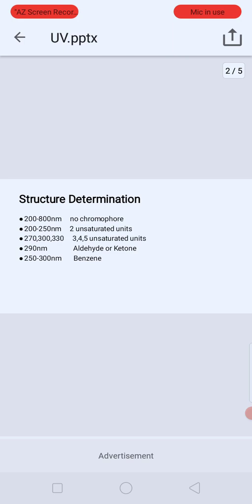Since different chromophores absorb ultraviolet visible radiation at different wavelengths, it is sometimes possible to identify the absorbing chromophore in an unknown compound by comparing the wavelength of its maximum absorption with the absorption characteristics of known compounds. However, it is usually not safe to conclude from UV visible spectroscopy alone. UV visible spectra are best considered in conjunction with infrared and nuclear magnetic resonance spectra.